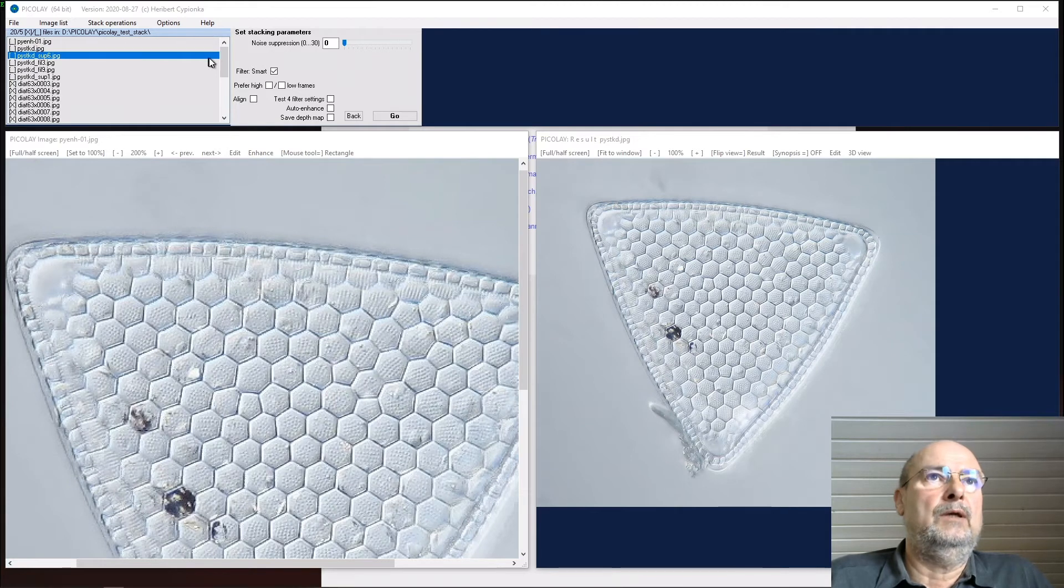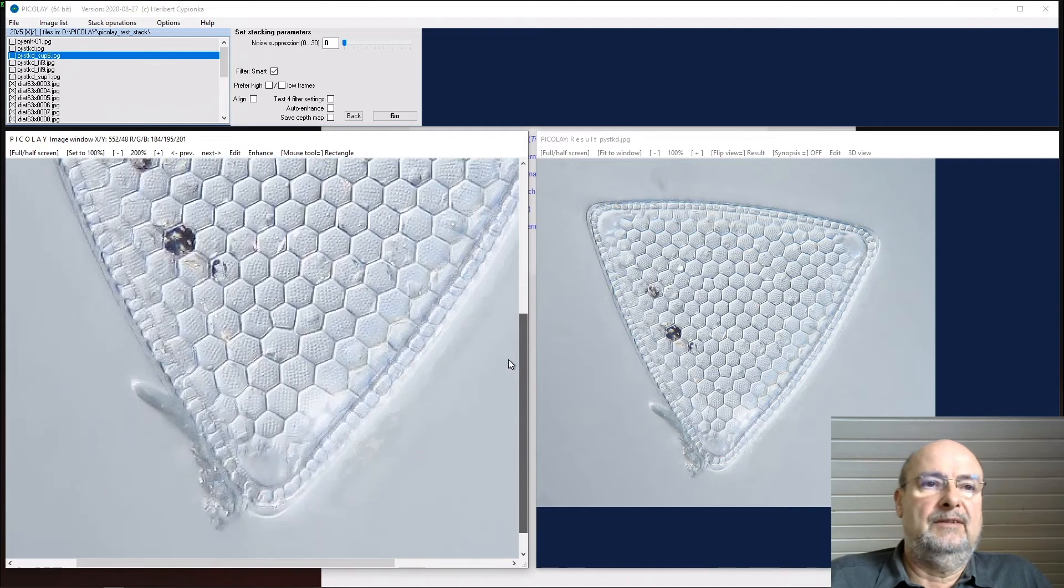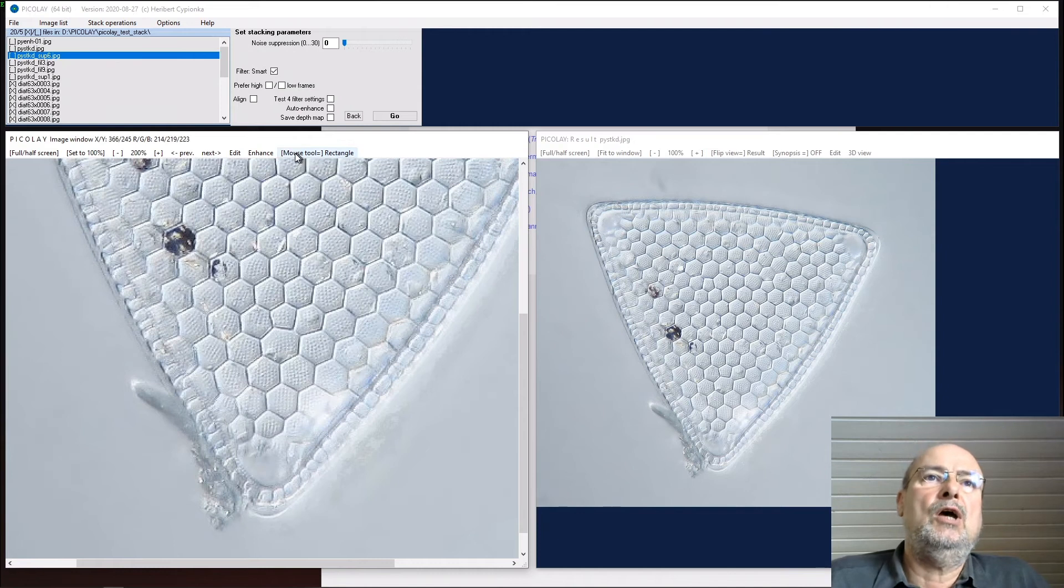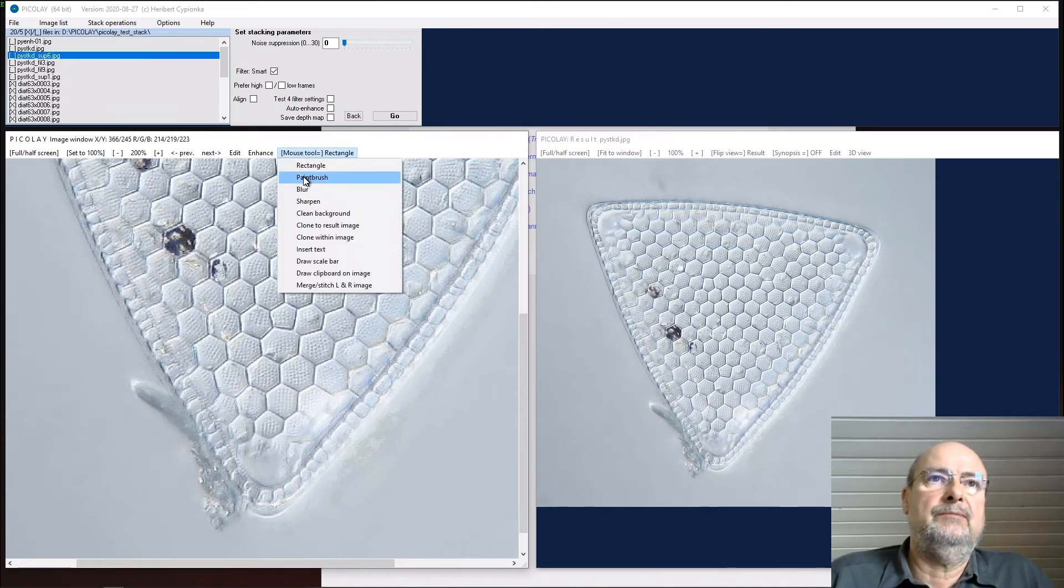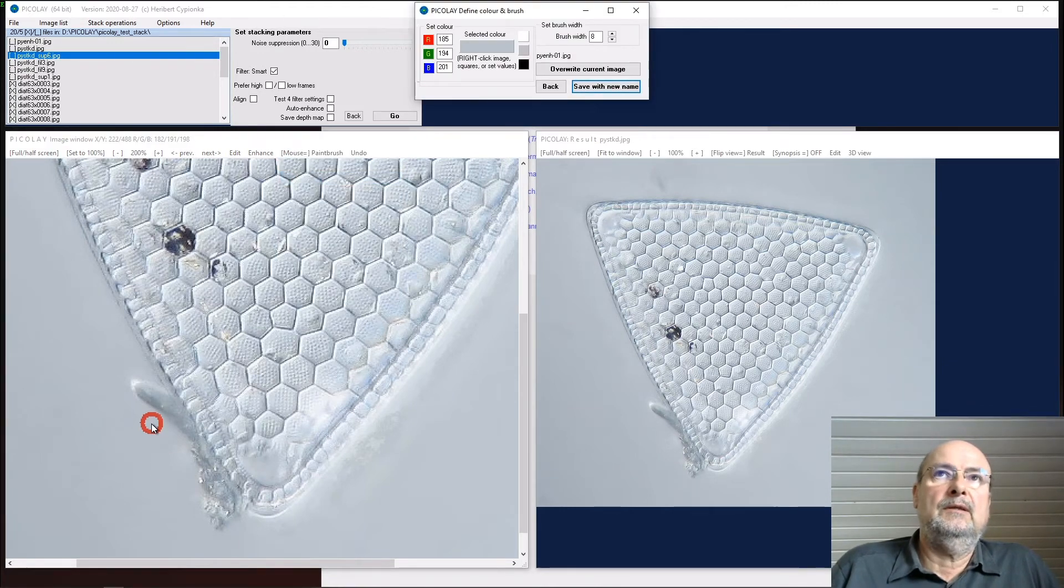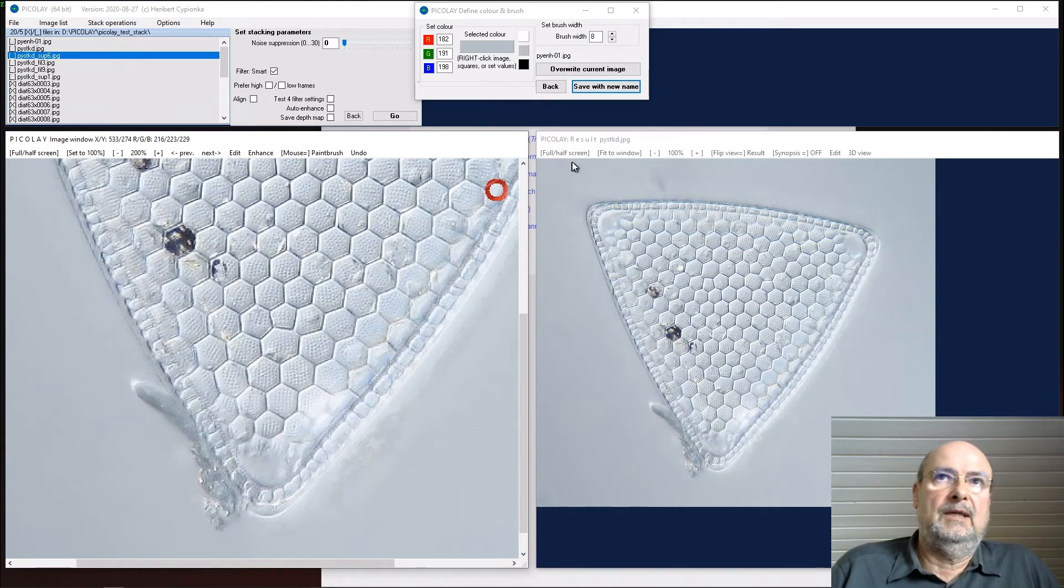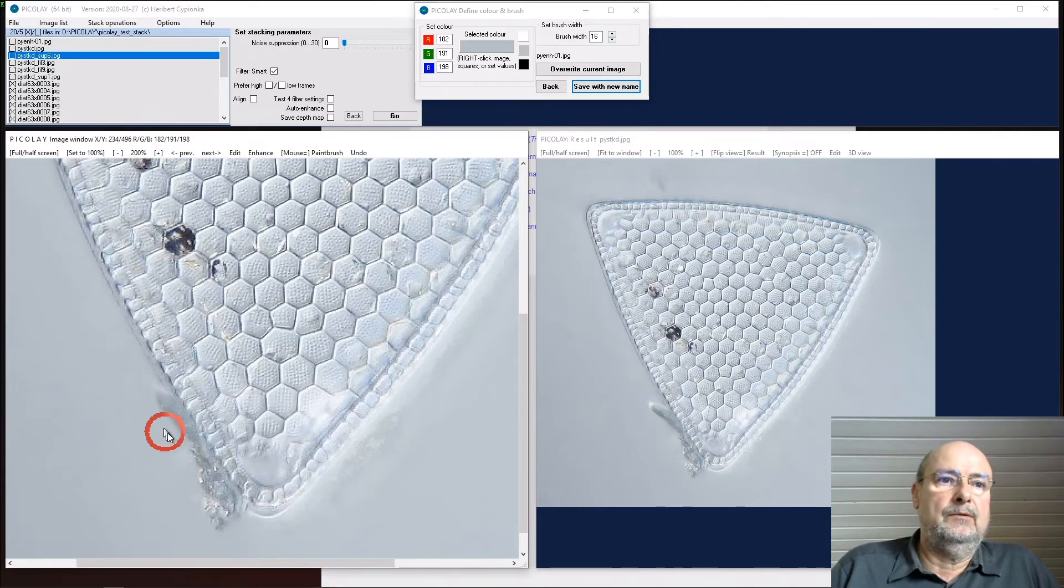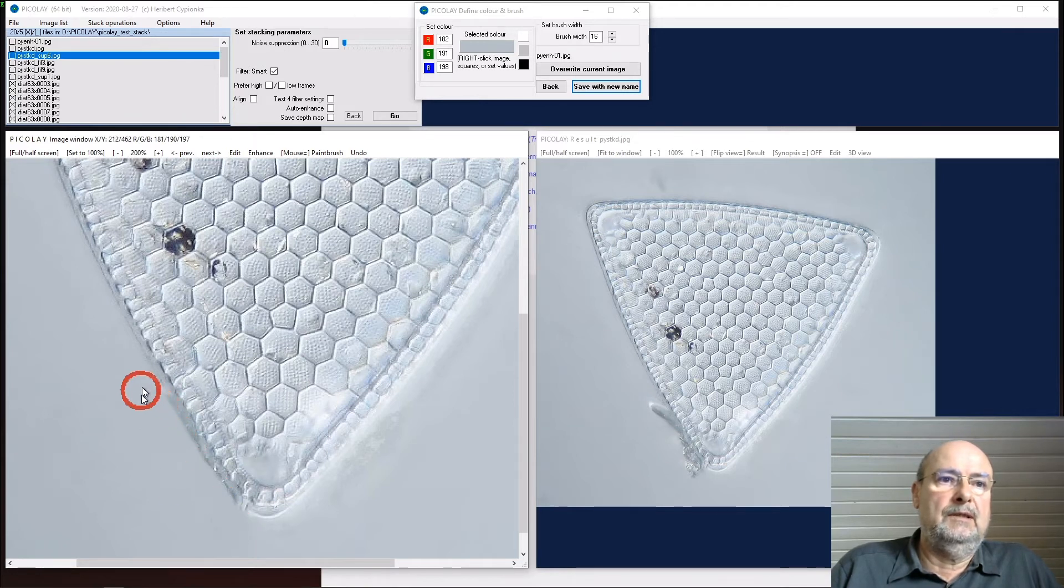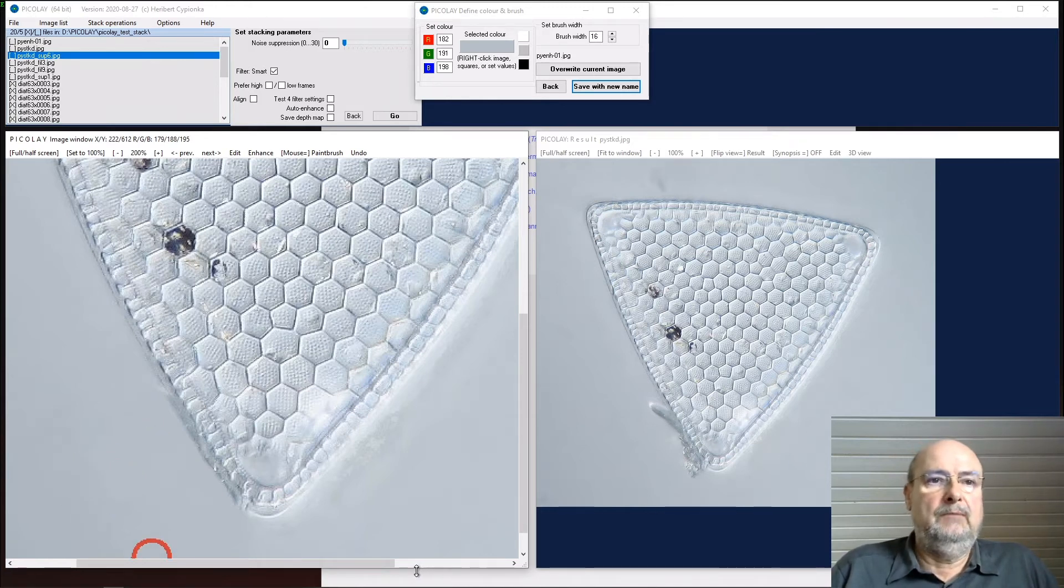I could say save this with a new name, and you have a new file here: Picolet enhanced number 01, the first enhancement. We could do some other things. Here we have structure that is not so nice and I would like to remove it. Could do it with a paintbrush again. Click close to the object to get the color from here - it might be different to what we had before. Can make it a little bit wider and I could clean it here. You would say okay, it looks already better than before, definitely.